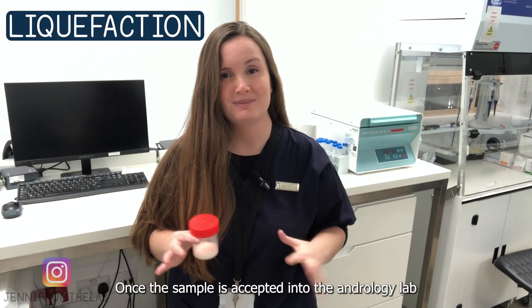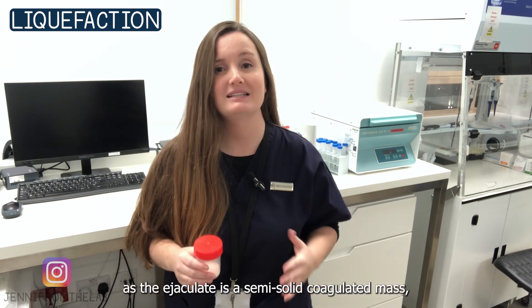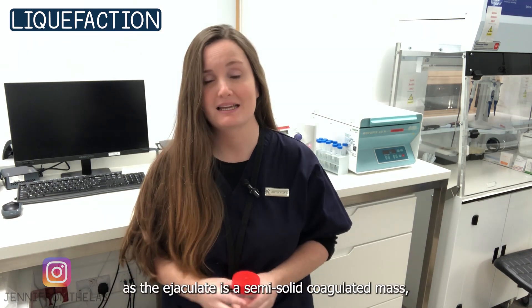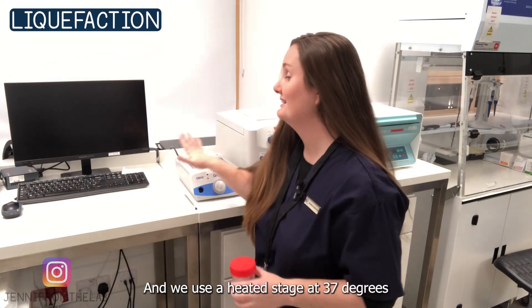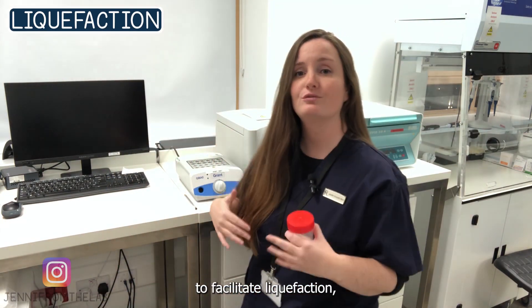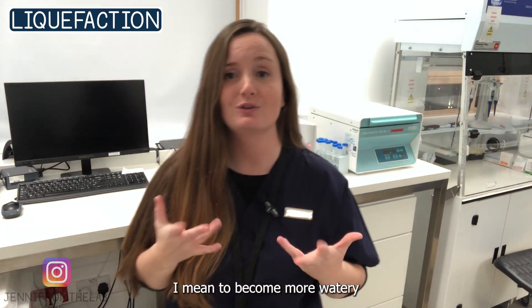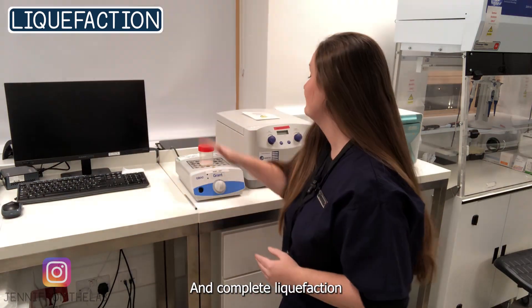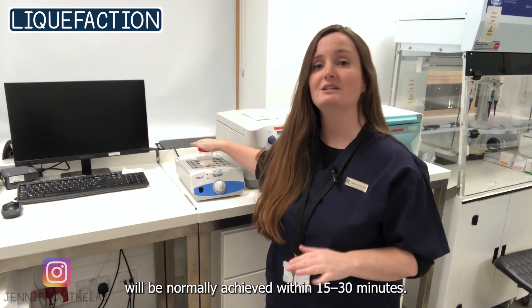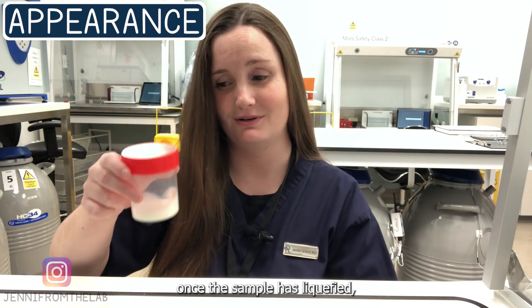Once the sample is accepted into the andrology lab, we have to allow it to liquefy. The ejaculate is a semi-solid coagulated mass — it looks like slime. We use a heated stage at 37 degrees to facilitate liquefaction, meaning to become more watery, though it will still have higher viscosity than water. Complete liquefaction is normally achieved within 15 to 30 minutes.